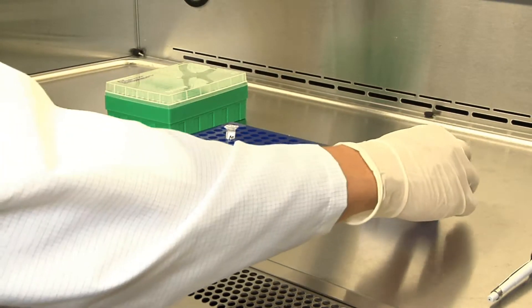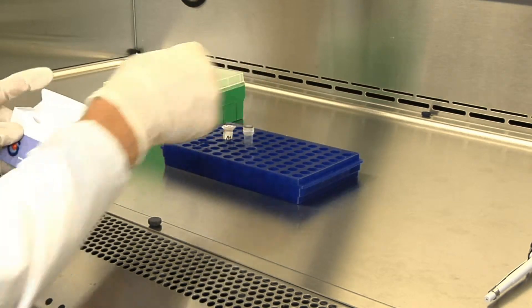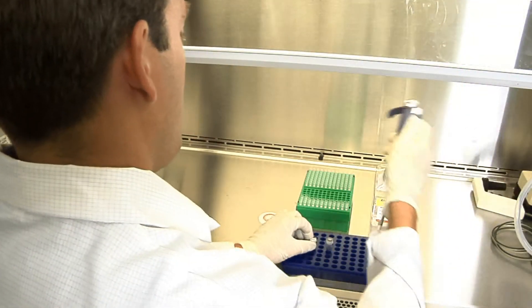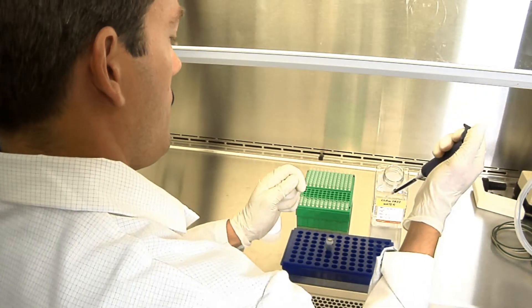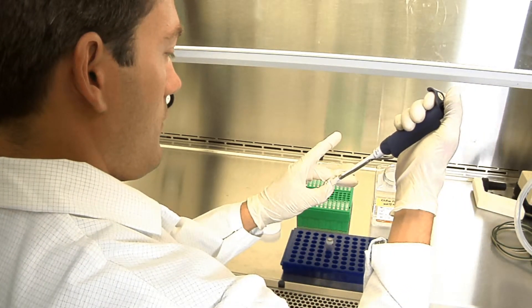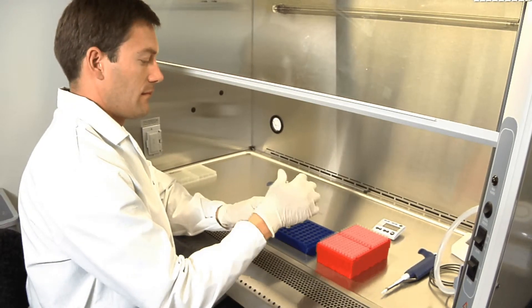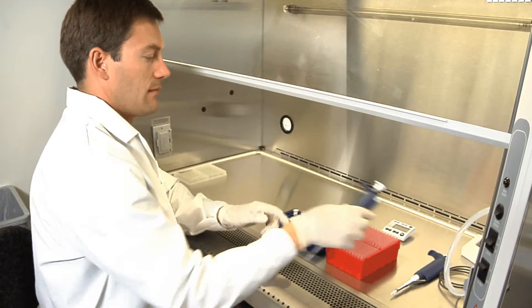On day 2, 24 hours post-cell seeding, prepare for transfection. Thaw go-clone reporter constructs and microRNAs at room temperature. Once thawed, mix well. Dilute the microRNAs to a working concentration of 2 micromolar in RNase-free water. Go-clone plasmid DNA is delivered at 30 nanograms per microliter and does not require further dilution. Each DNA-RNA combination should be transfected in triplicate, and volume should be scaled to account for the number of assays being performed.